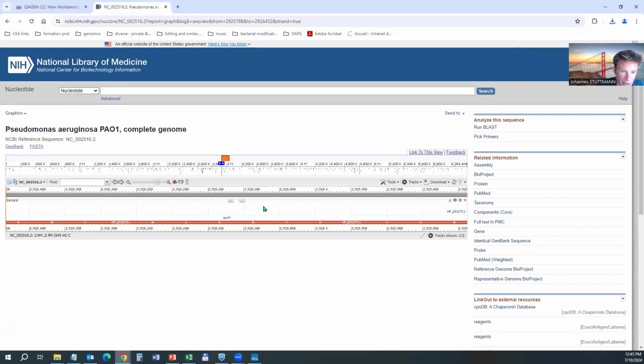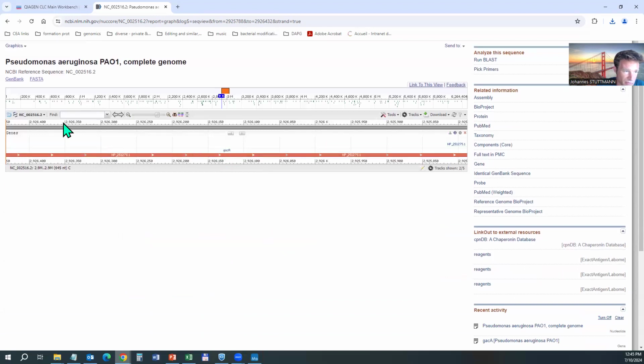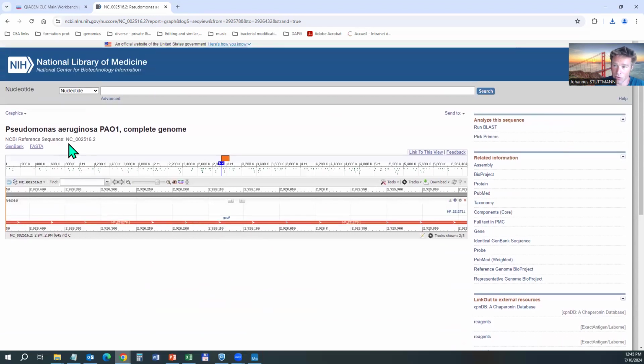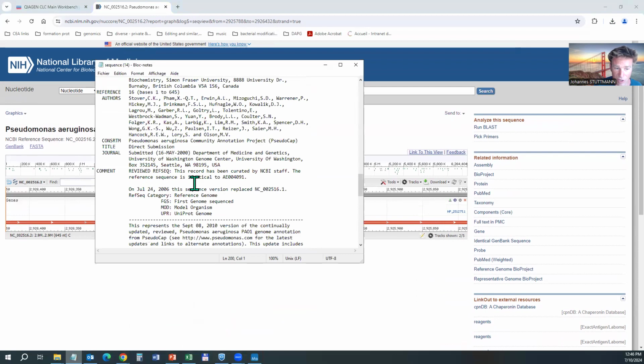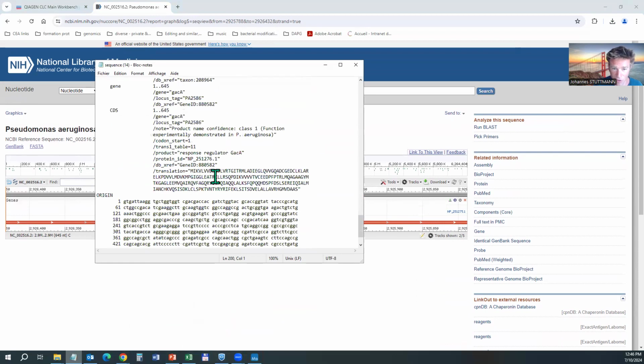So we would here now have a graphical interpretation of this GenBank file. These are nice files. There is a lot of information in there. The thing is that, of course, as long as we are on NCBI, we cannot change anything of this. And as soon as we have opened this as a text file, it is also very bulky. If I want to, for example, add something here, it doesn't make much sense. It won't help me. And this is where software like CLC Workbench and so on comes into play, because it helps us to visualize these files and to also edit them.